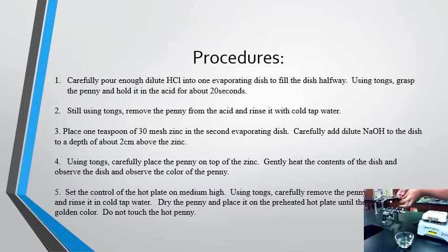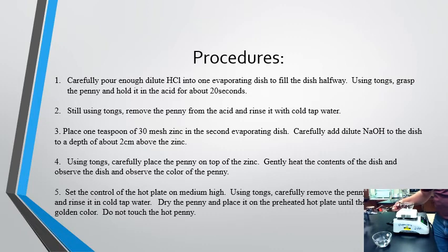Okay. Now, I'm not going to waste any of the sodium hydroxide solution now, but you would have the zinc and the sodium hydroxide solution sitting on your hot plate. You can take a paper towel, dry off your penny, and then you can just place it into your zinc and sodium hydroxide solution. And at this point in time, it's just a waiting game.